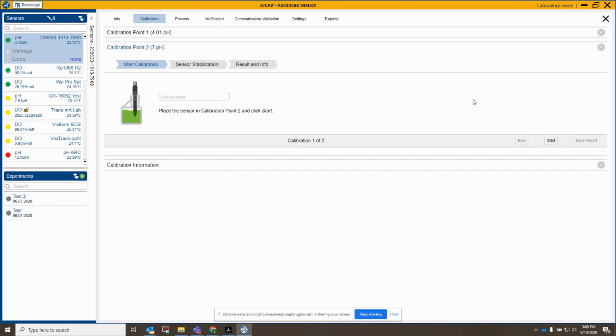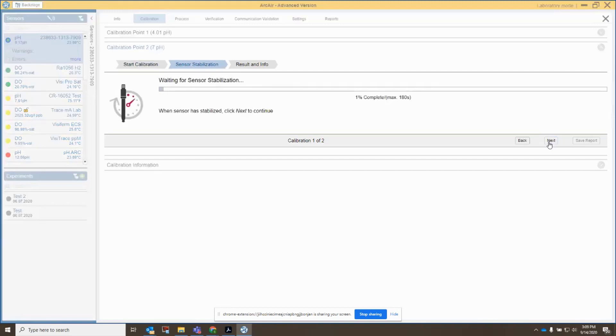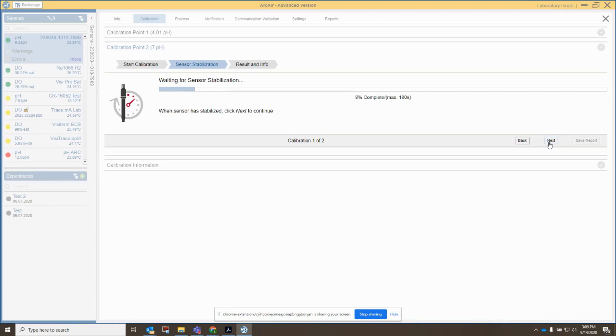So I'm going to calibrate at 9.21 pH buffer. So I'm going to move the sensor over to that, and we'll see what it looks like to actually see the RK recognize a different buffer value. So I'll put in a lot number, and my sensor is right now reading 9.15. It's getting very close to the value already. So let's give it a second here to stabilize, and let's see what we've got. And that's probably enough time. I'm going to click next.